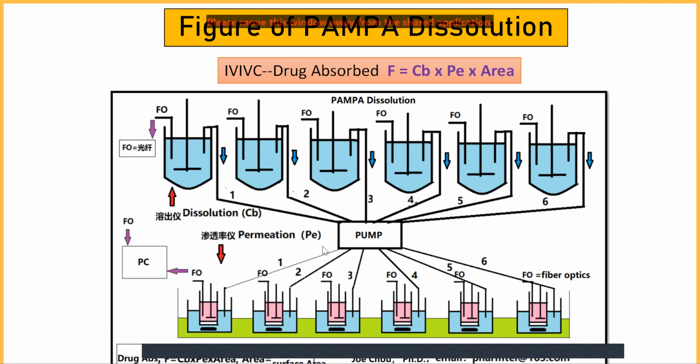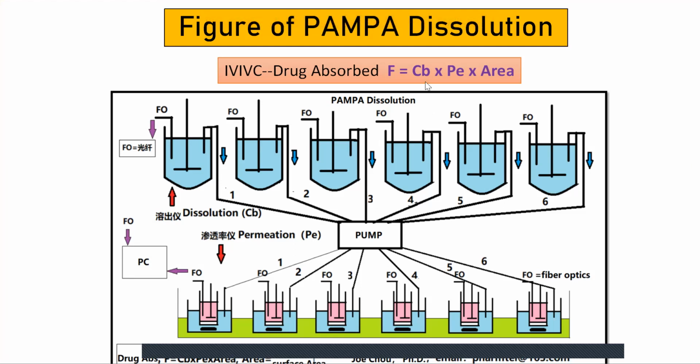So both parameters, permeation and dissolution, are recorded through the fiber optics to the PC with respect to time, and these two parameters correspond to the IVIVC model.